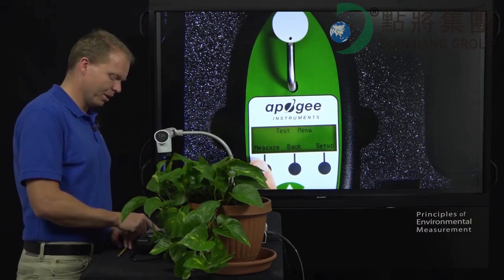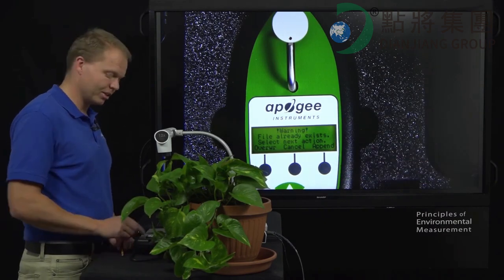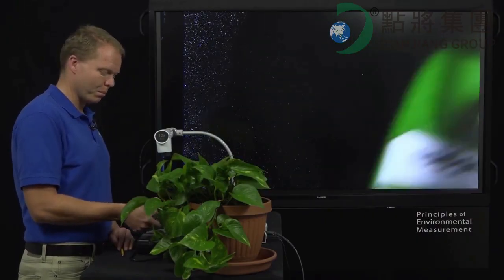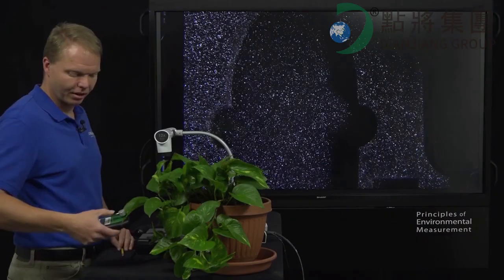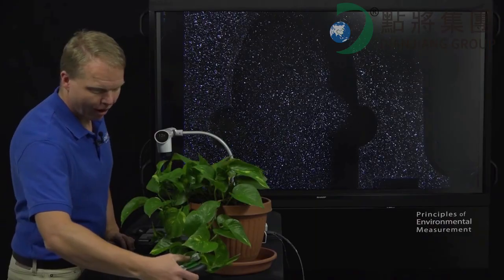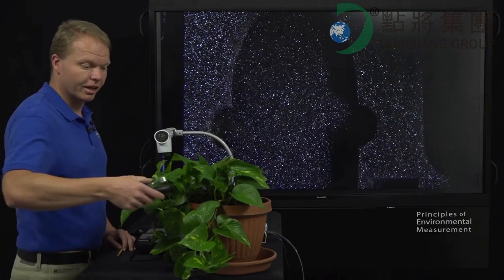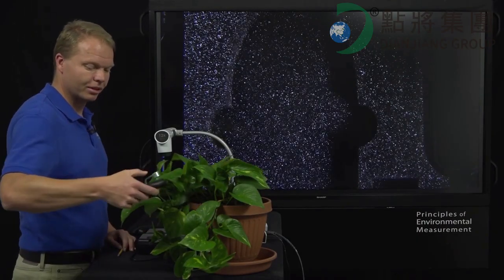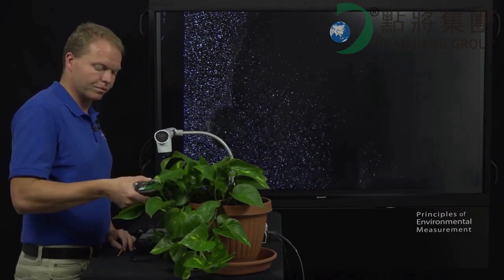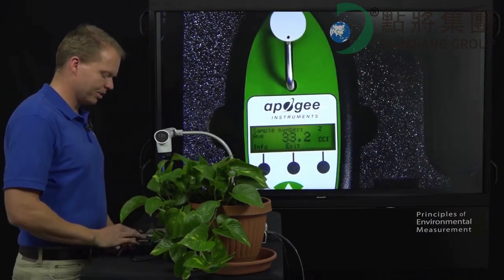So we hit exit, we hit measure. It's going to say you're on that same file. Do you want to override or append it? Well, in our example, we just want to append it. So we'll just hit there, and then we're good to go. And that's our first reading. Our second reading. And our third reading in CCI. And again, just for uniformity, we will go ahead and take 3 more. Okay, so we now have all these measurements saved on here.